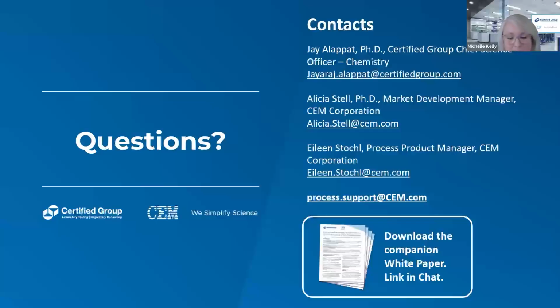Okay. And Dr. Alicia, I have one more question for you and then one for Dr. J as well. When putting the sample on the pad in the Smart 6, this person was taught to put the dots in a swirl and not touch. Is this true? They have also seen people just put it all in the center. What is your take on that? Sure.